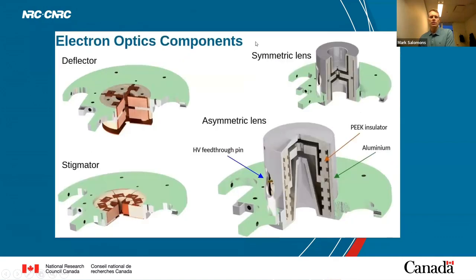On the right we have our lenses — a very simple lens with a plate in the middle that you apply your voltage to and then grounded caps. We've worked out all the distances, tested it, with an insulator separating the two sections. There's an asymmetric lens for once you get close to the sample, where you want the lens as close to the sample as possible. We've also developed double plate deflectors for symmetric or parallel deflection, and stigmators to shape the beam.